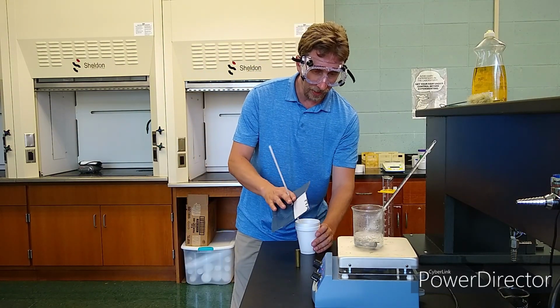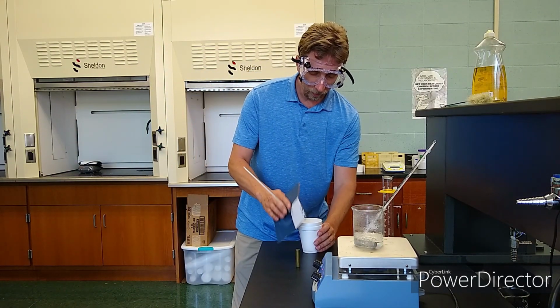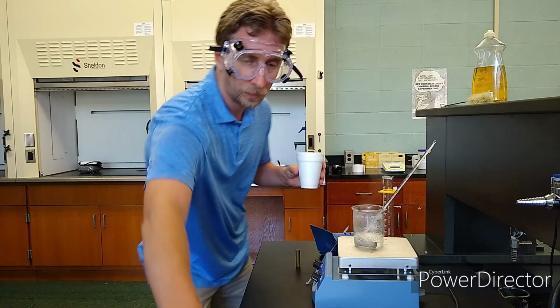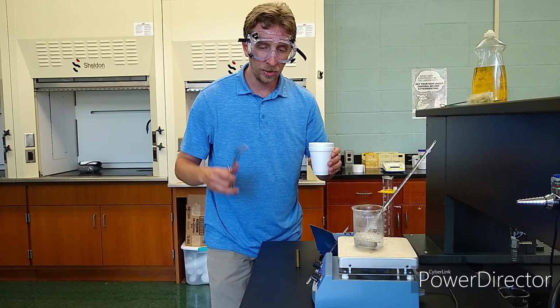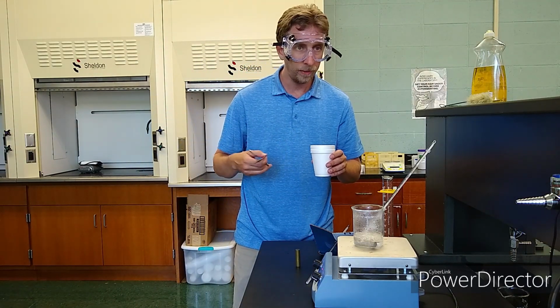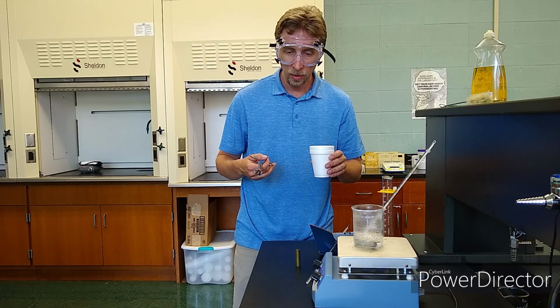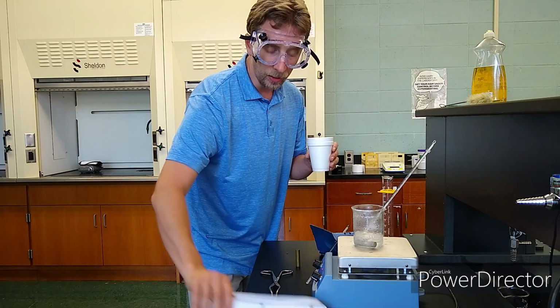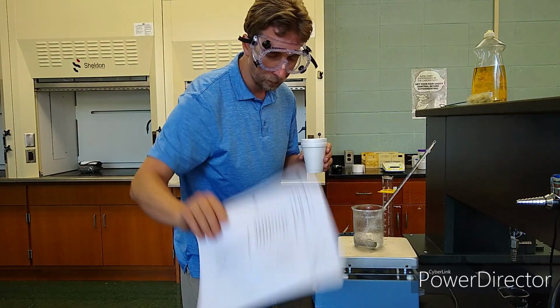Now, the big step here for the experiment is transferring the hot metal into the calorimeter, putting the lid on there and swirling and measuring the temperature change every 15, 30, 60, 90, 120 seconds, as it says on the data sheet here. Right?